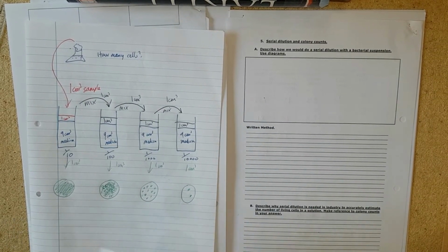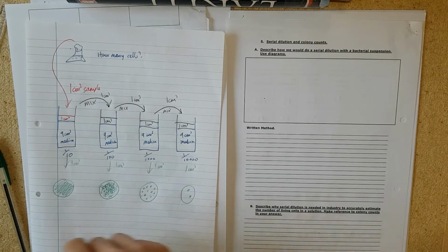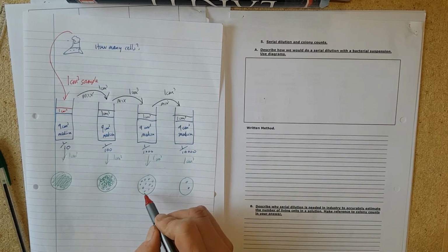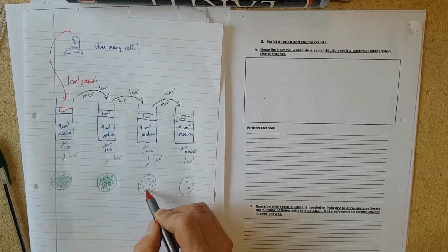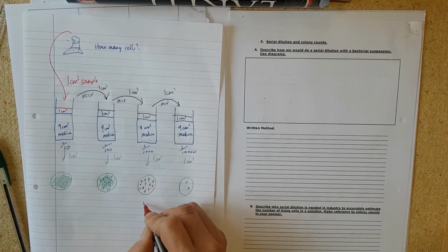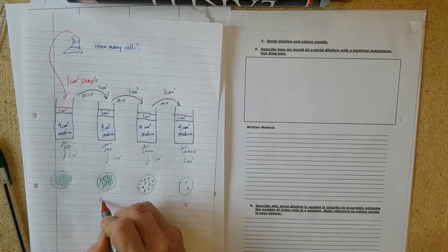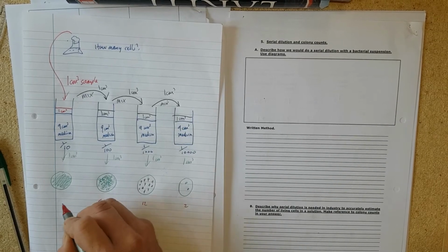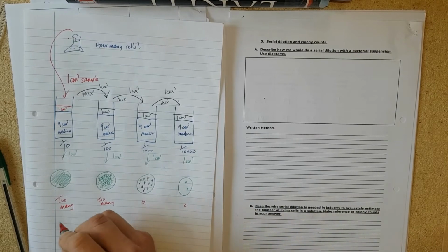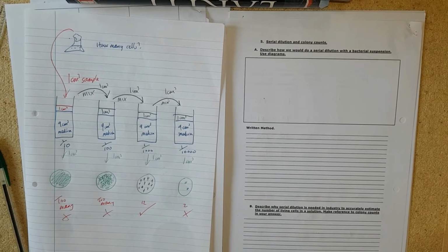them easily. But then what you need to do is, you might think now, okay, I've got, for this one, how many colonies have I got? 1, 2, 3, 4, so I'm going to count them off. 1, 2, 3, 4, 5, 6, 7, 8, 9, 10, 11, 12. So counted 12 on that one, 2 on that one, too many, and too many. So not going to use that one, not going to use that one, not going to use this one, but I am going to use this one.